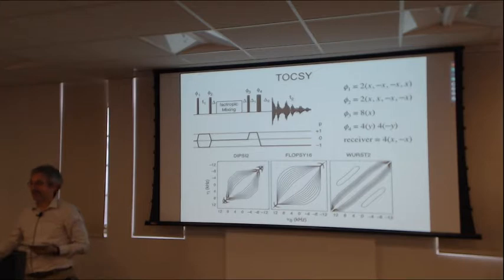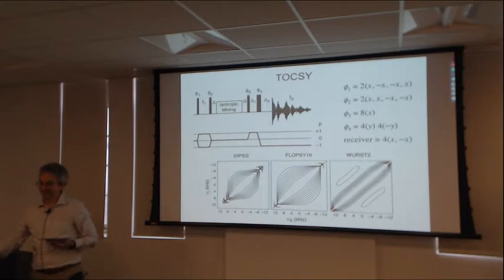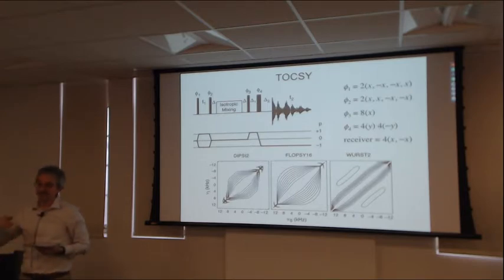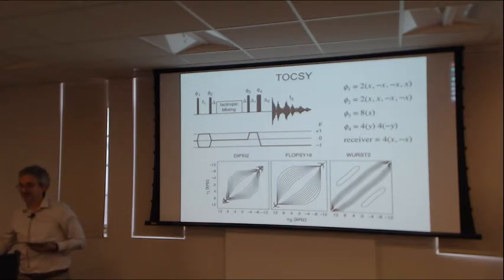And people had very elegant ideas for how to improve approximate solutions so that if you had a solution that worked somewhat well, you could iteratively improve it. So there was WALTZ-4, and then WALTZ-8, and WALTZ-16, WALTZ-32, WALTZ-64 were iterative ways of improving the primitive sequence to make it perform better and better. And there were symmetry reasons why one expected these schemes to work.